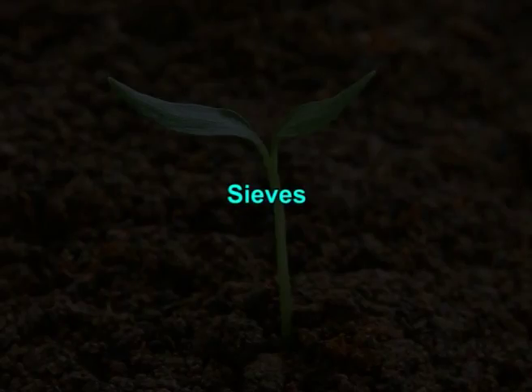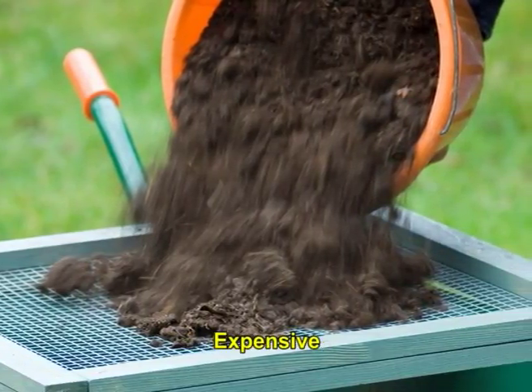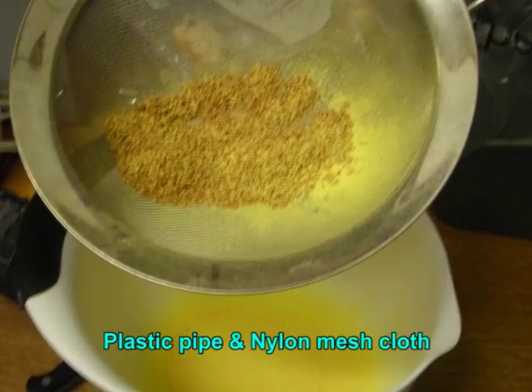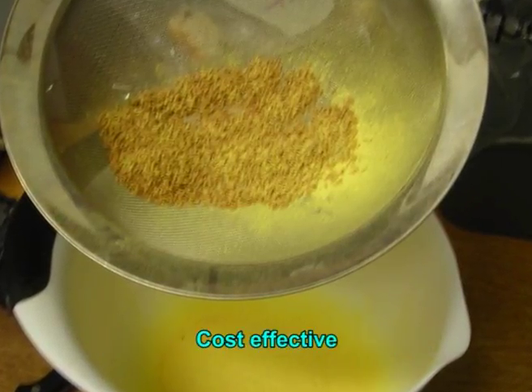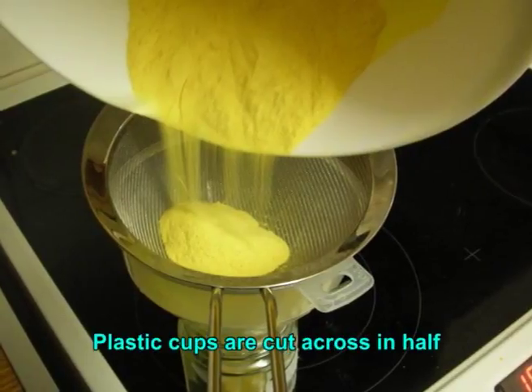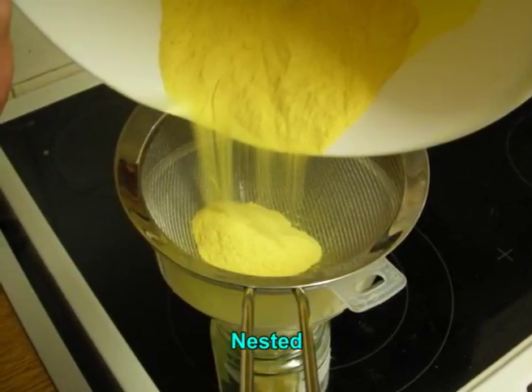The sieves. Stainless steel sieves of accurately graded size are used. These sieves are quite expensive. They can be substituted with sieves made out of plastic pipe and nylon mesh cloth of known mesh size, which is comparatively cost effective. These are fixed over pipe like embroidery hoops. Also, plastic cups are cut across in half and nested together in order to construct sieves.